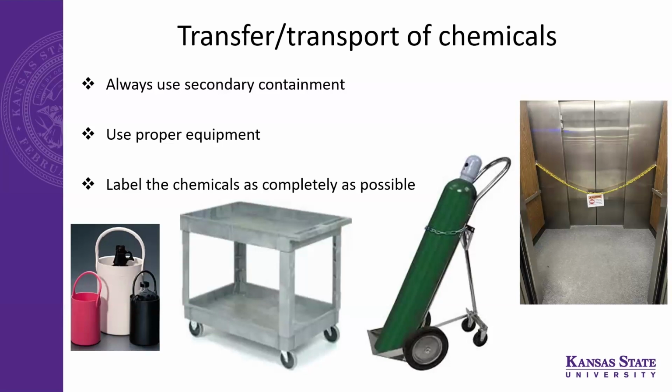So this is one of our elevators. If you are using the elevator, we have this sign and we block the entrance with the chain, and the sign says danger, chemical transport in process. And you can also have people at the different levels of the building while the process is done.